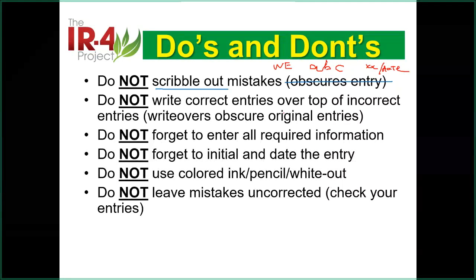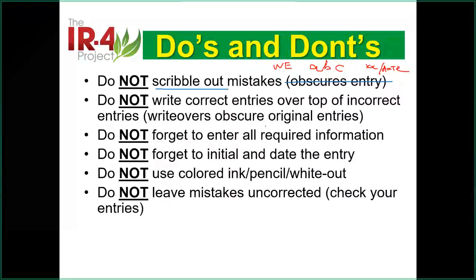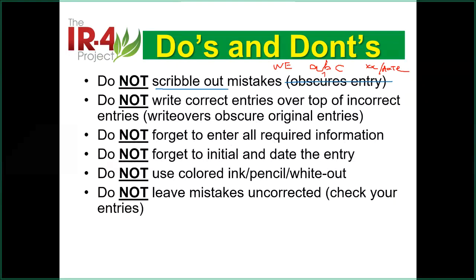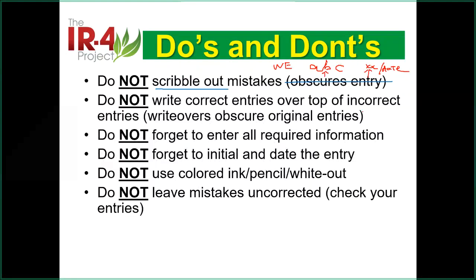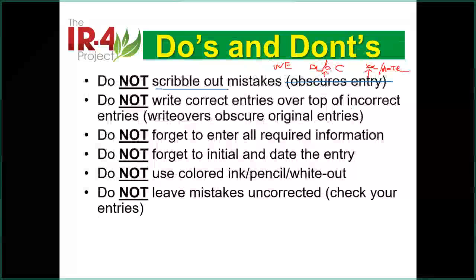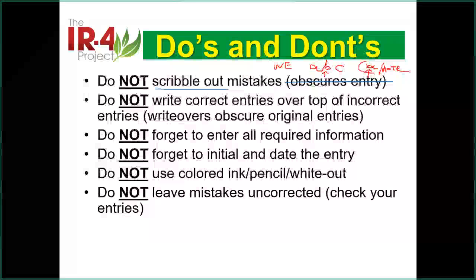I just want to add one statement here, because sometimes if this WE answer is too short, nobody knows whose it is, since somebody's initials may also be WE. So in my lab, we make it a little bit easier: you write the date and the signature together, and that's your signature.